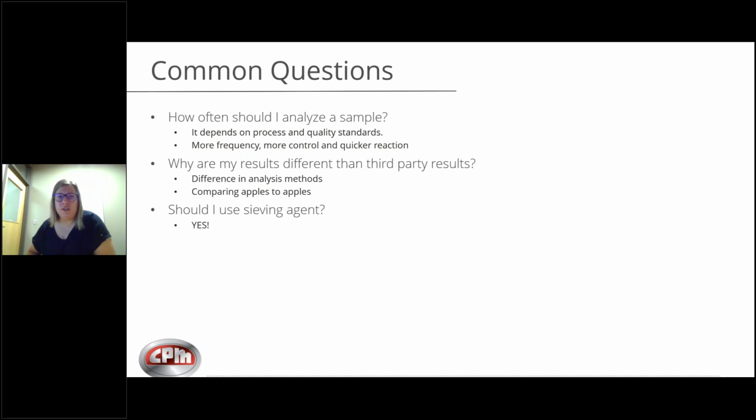Other common questions we receive: how often should I analyze a sample? This depends on your process as well as your quality standards. But keep in mind that the more frequently you analyze a sample, the more control you have over your process, and therefore you're able to react to any changes in your process quicker.